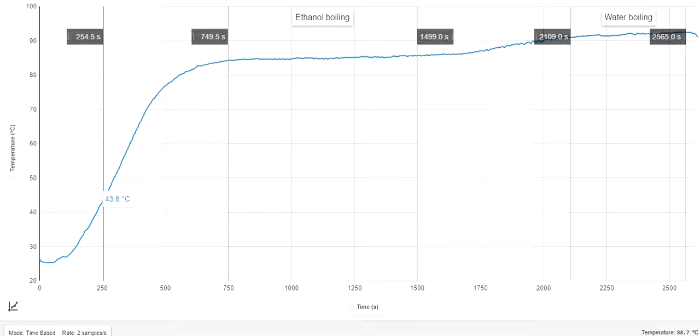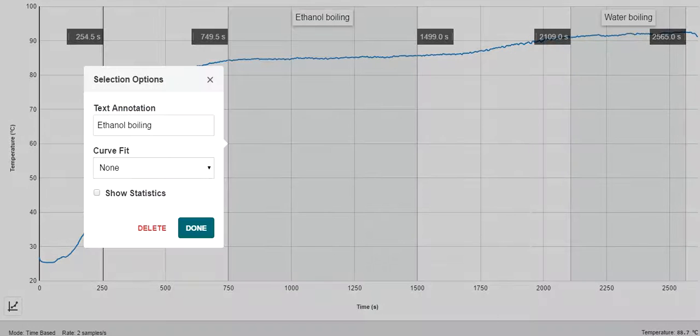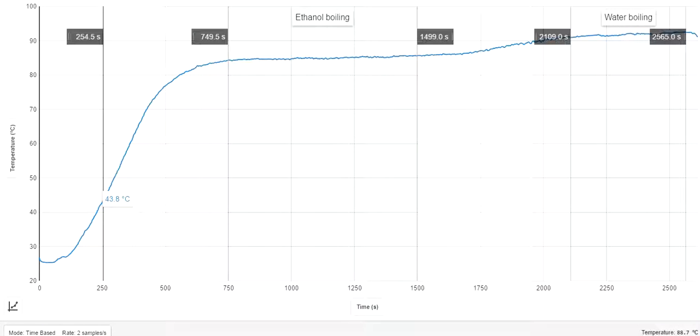And the reason I know it's not the ethanol and the water is because, look at this, flat line, and then once we get to about 1500 seconds, right at that, we start increasing. That energy is no longer flat like it was. There's a noticeable increase in the slope here, which means that energy is now being used to speed up the particles. Well, what particles would be left after I flatlined? The only particles that would be left would be water. And so therefore, this is the boiling of the ethanol. Then I increase it, and then I boil my water.